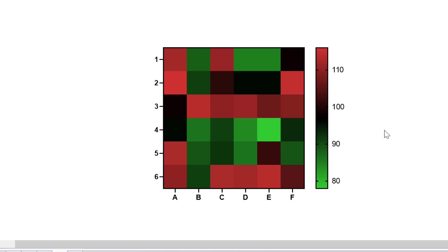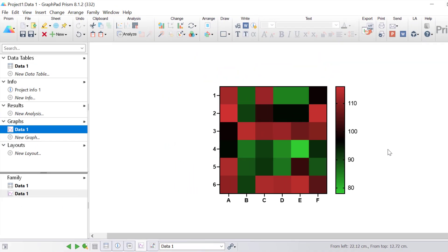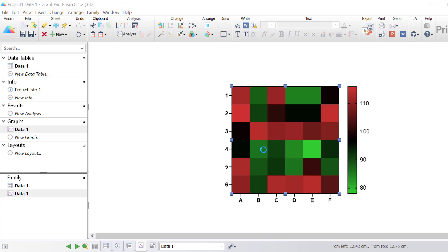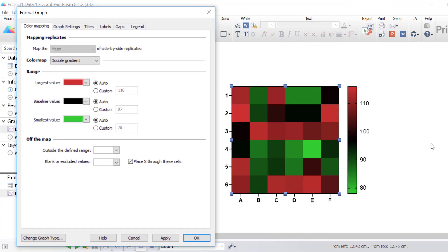To change the appearance of the heatmap, you can either click on the Format Graph button or double click on the graph itself. With the colour mapping tab selected, the first option is Mapping Replicates. As mentioned, if you have entered replicate values side by side, you can choose here what you want the heatmap to be based on — the mean, median, or geometric mean. You can even base the heatmap on the standard deviation, the percentage coefficient of variation, or the standard error of the mean of replicate values.